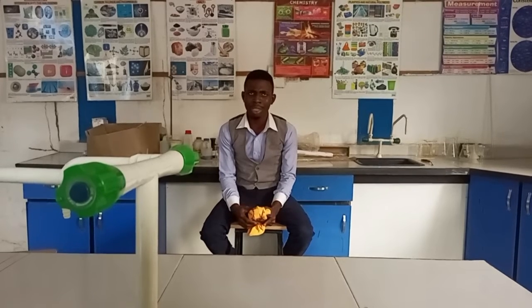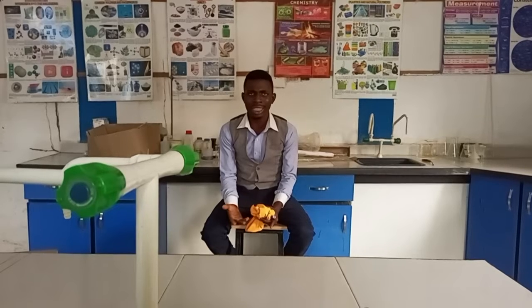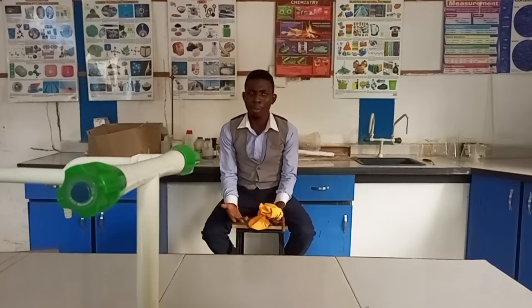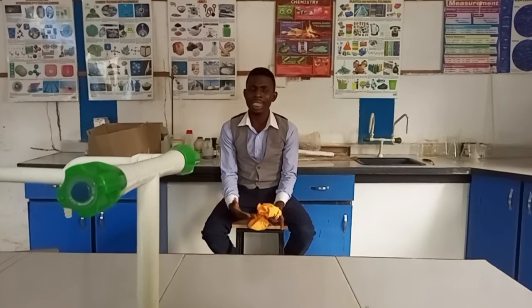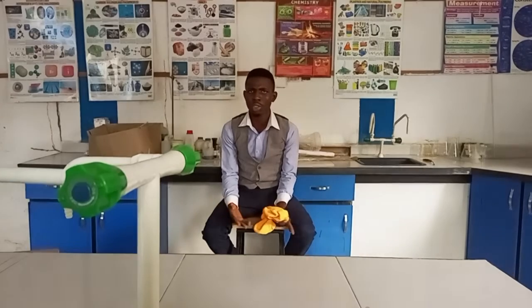Another question that can actually be asked for this titration experiment, remember that you are not practicalizing this experiment, but there are some certain questions they can actually ask you. What are the precautions that are being put in place when performing your titration experiment? These are some of the likely questions that the examiner will decide to find out. What are the precautions when performing a titration experiment?